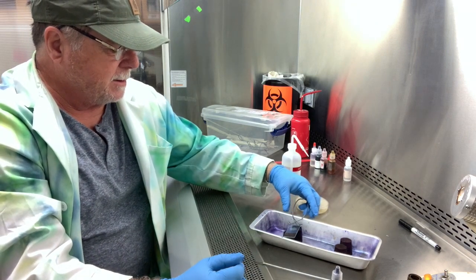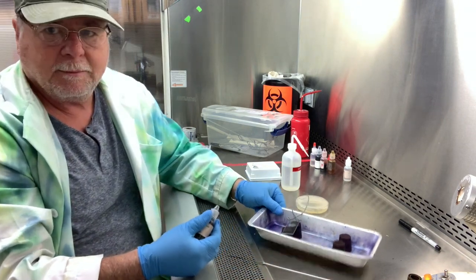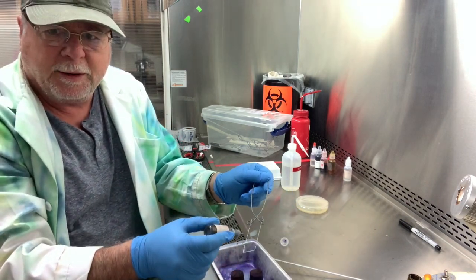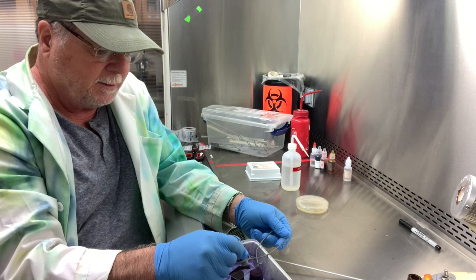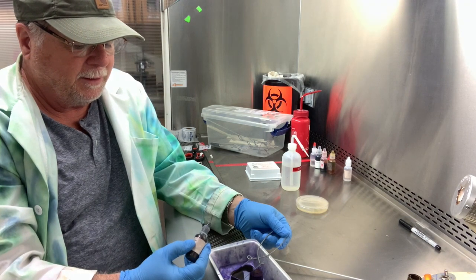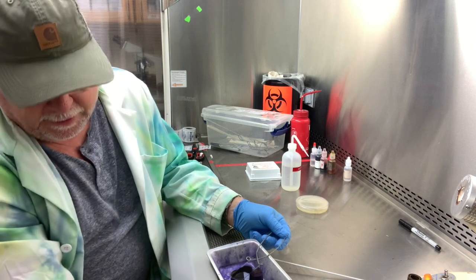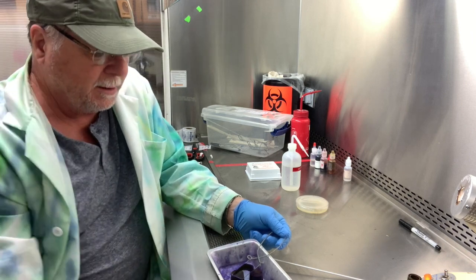All right, so if you go back onto the corks, at this point, all I have to do is the staining. So I'm going to get Crystal Violet, and put a drop on the surface, and we just want to flood that area so that all the bacteria are covered up. And we'll leave it on there maybe 15 seconds to 30 seconds, and then it gets rinsed off. We're just giving it time for the bacteria to get stained. So our protocol here in our book says 30 seconds.